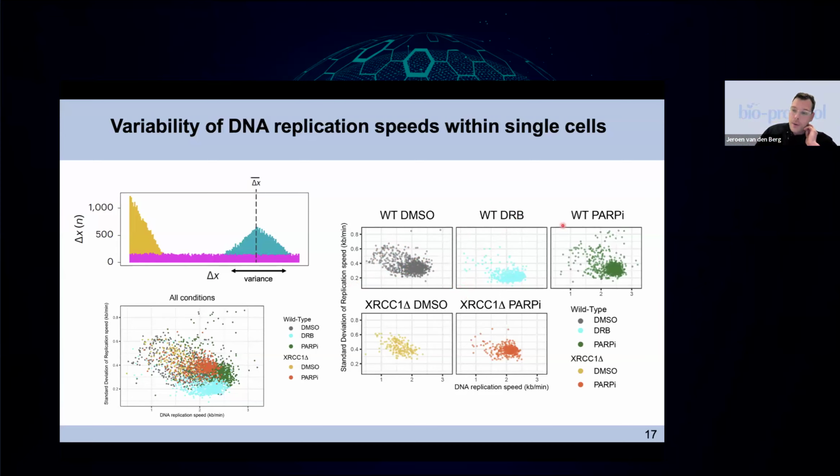And if we use a PARP inhibitor, we see that they're even faster, but they seem to be a little bit less synchronous, maybe due to the fact that they encounter lesions that they are physically stopped by, that are now no longer sensed in the PARP inhibitor condition.